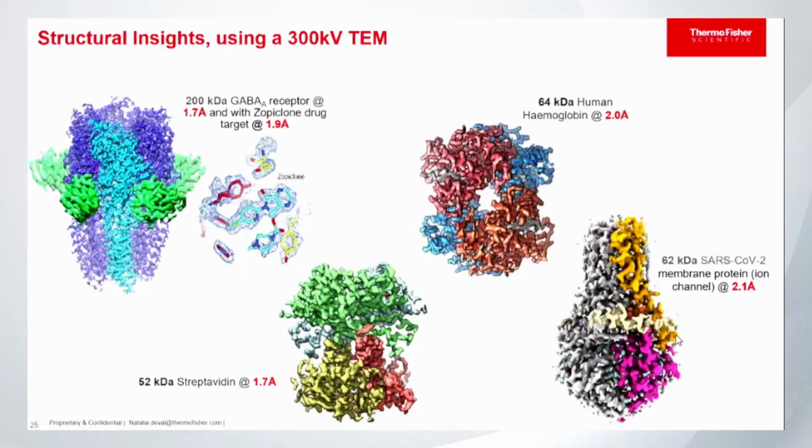But the disadvantage is that it's still ex situ, okay? You still need to express and purify your protein of interest, put that in a cryo-EM grid, go to the microscope, and collect data. More and more people are saying, okay, it's very cool to have the high resolution of your protein of interest, but what happens with that protein in the context of the tissue, the context of the cell?